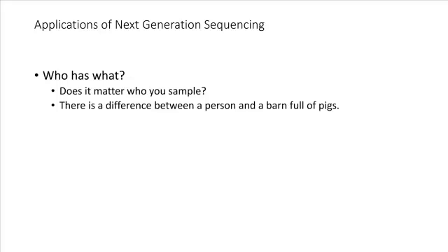So if we go back and look at this same chart, and you send a sample in and you want to know everything that's in there, well, it really depends on when you take your sample. If you've got a chronic pig, you send it in, I want to know everything that's in there, it's going to be different than when you're looking at an acute infection and you say, I want to know everything that's in there.